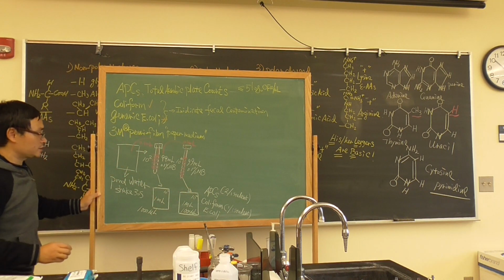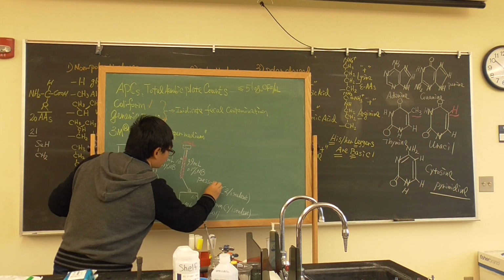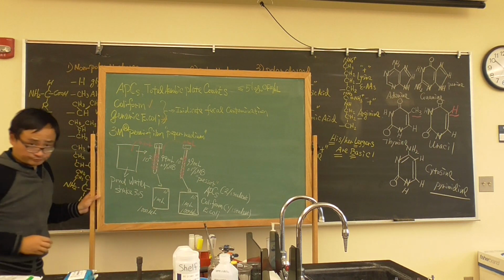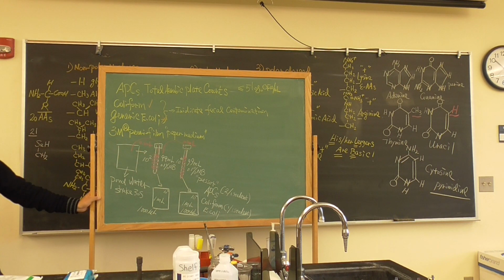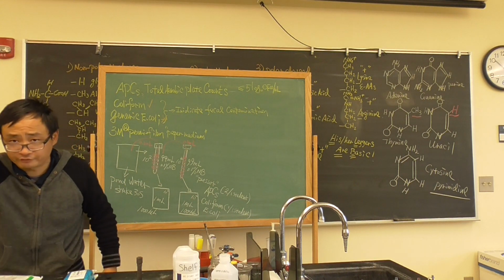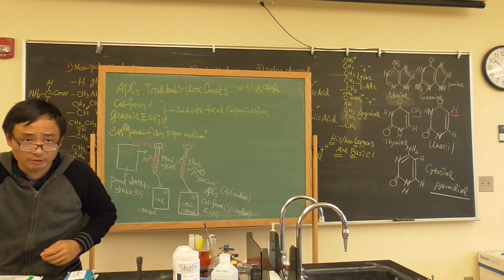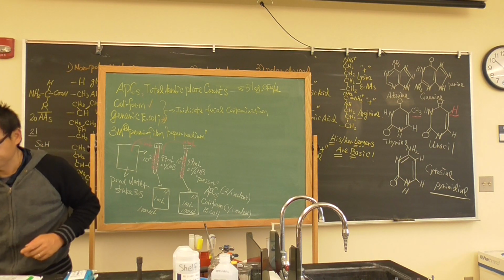And for the APCs, we need a presser. I will get a presser real quick into my lab. So you guys get the plates, get the petrofilm to do the label first, and do the dilution first, and wait for me to have the presser. And I will show you real quick how to do. And for this petrofilm, you just gently cover it. It's good. But I will show you because you have to avoid the bubble.